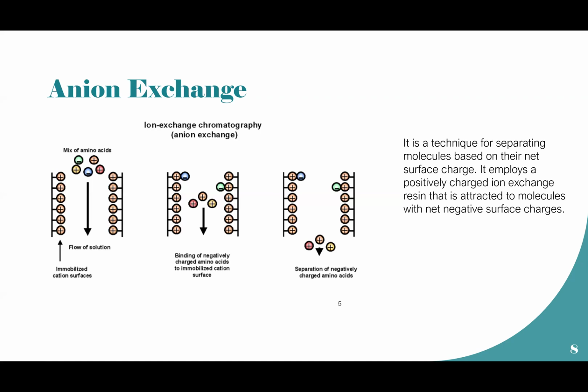Depending on your solution and the type of resin you use, it's going to stick to the surface of the resin, and then the stuff that you either don't want or do want will flow right out. It depends on which type of chromatography you're performing.